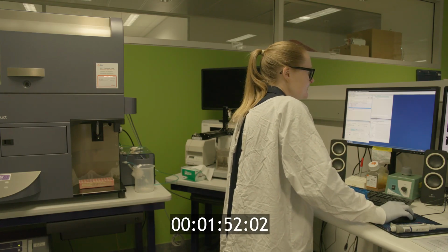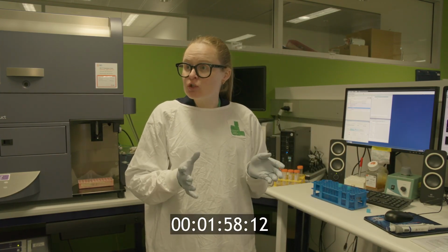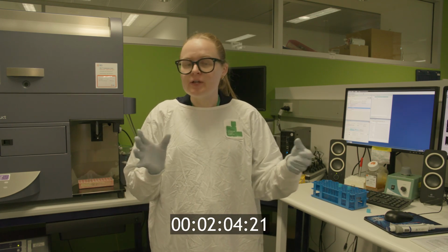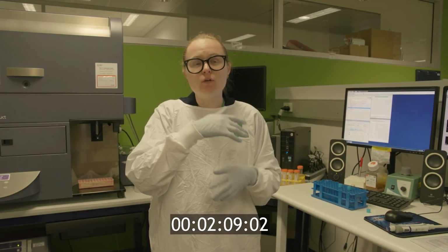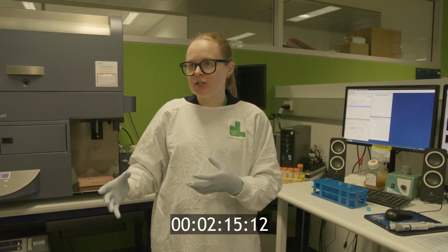So I've got some cells in here. I've manipulated these with CRISPR. CRISPR is a gene editing tool, so it allows us to edit the DNA within the cells of interest that we're using. CRISPR was originally developed from the bacterial immune system, but what's really important is how we use it in gene editing.